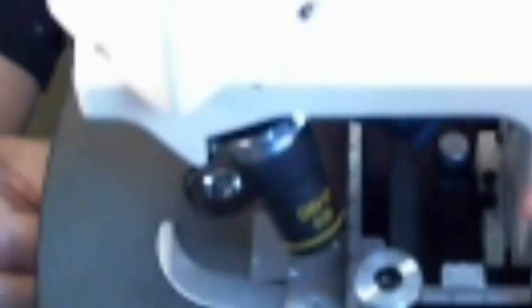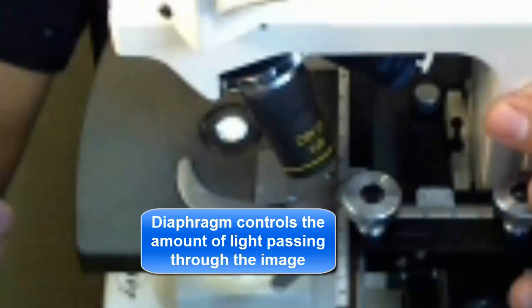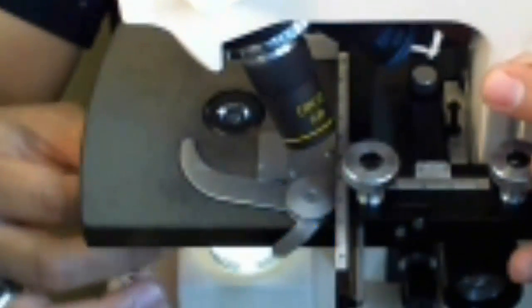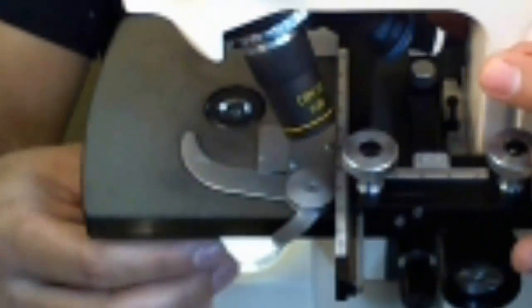If the diaphragm is all the way open, all of the light will pass through as much as possible. But if I turn this little lever, it slowly closes the amount of light available to go through. It's important to let enough light pass through to see the image, but not so much that it overpowers the image. If it's too bright, all you'll see is a white screen. So you find that balance — that's what the diaphragm is for.